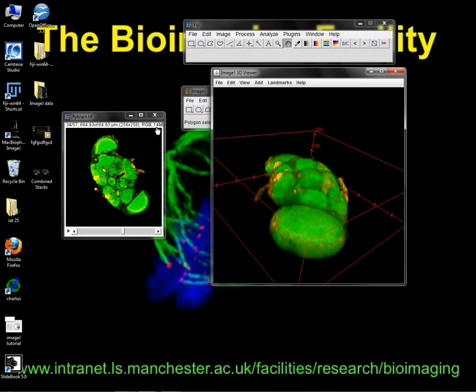You can see how bright this is. So this is the thing, good data in, you get lots of options to do lots of good things. Crap data, you're gonna struggle. And if you try doing a volume, it's gonna look pretty shocking.